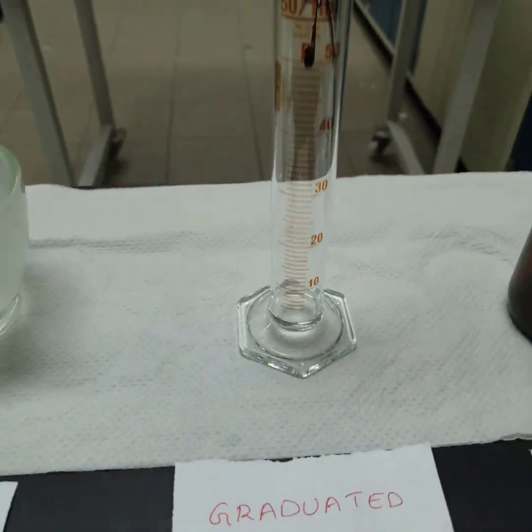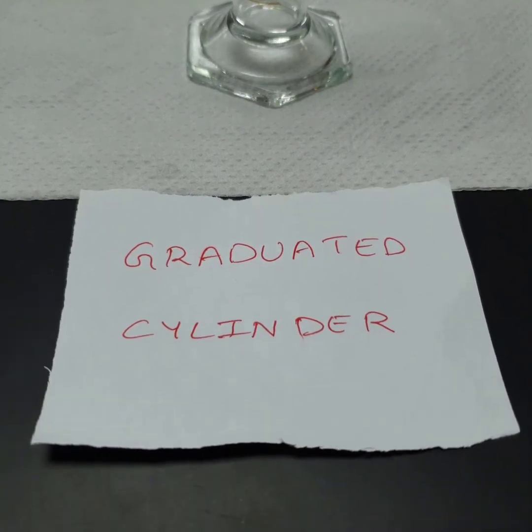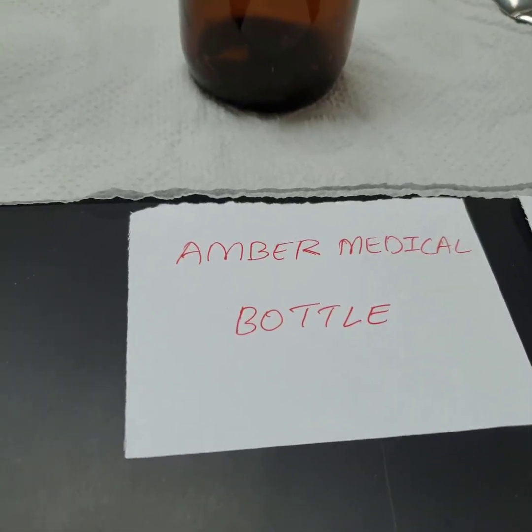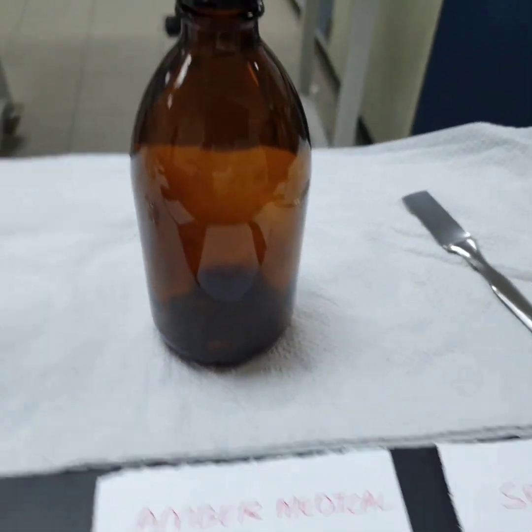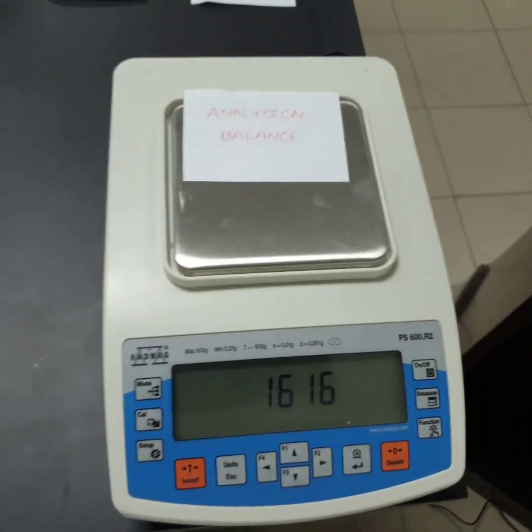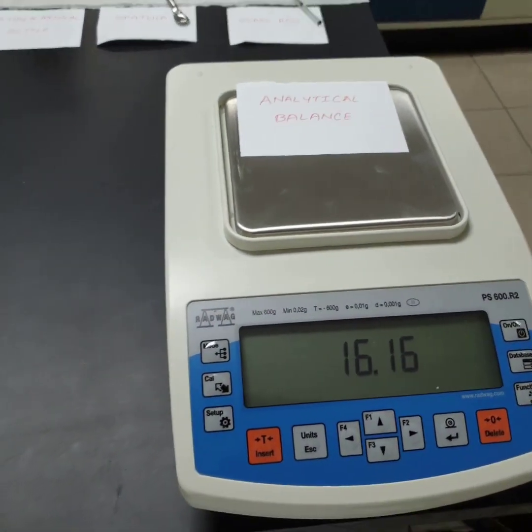We are going to have glassware of 50 ml graduated cylinder so that we can put the final volume of this suspension in this graduated cylinder. And then for our last step, we need to transfer the contents to a prescription bottle, which in this case is an amber glass medical bottle. So we are going to add the final product here, and then we will be needing spatula for powders and also glass rods for mixing, and we are going to need analytical balance for weighing the powders. So if we get these ingredients, we can easily prepare clobazam suspension.